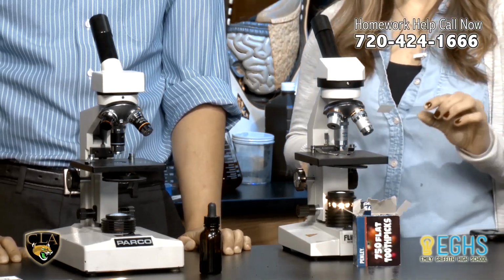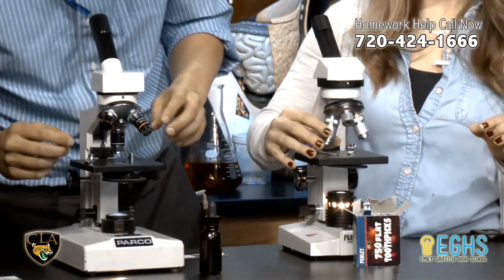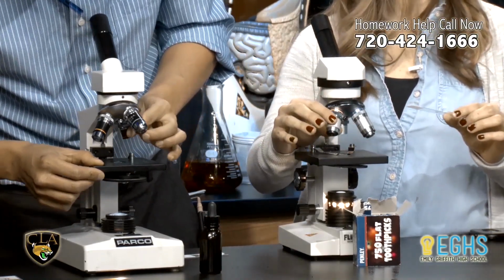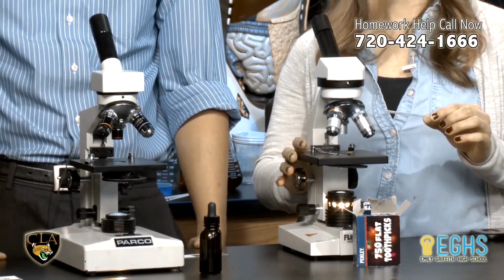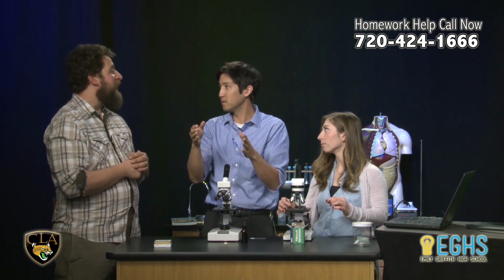So what I want you both to do is first set your objective lens to the lowest power. Lowest power? Yeah, and we always want to start on microscopes at the lowest power objective lens because that gives us the broadest view, and that makes it such that we can see what we're looking at, and then we can zoom in from there. Right, because if you zoomed in a lot and you just had a lot of blue, you'd be like, I don't know which direction to go. Right, and we can often see clumps of cells as we look from above, and then we can pick one that looks like a good clump and zoom in.